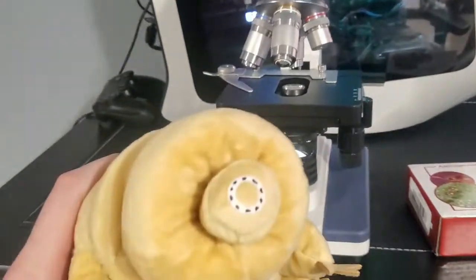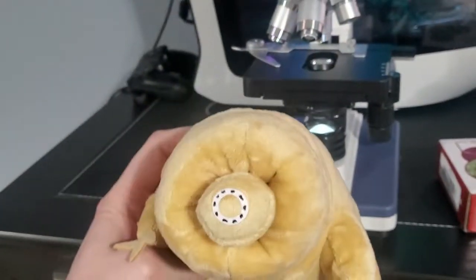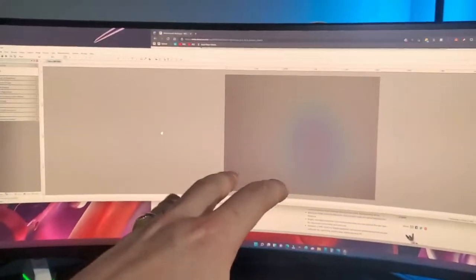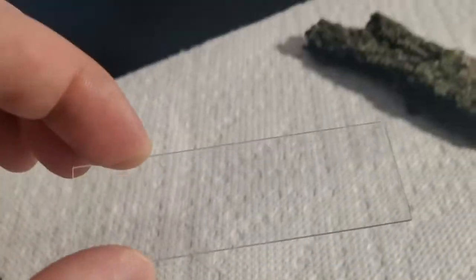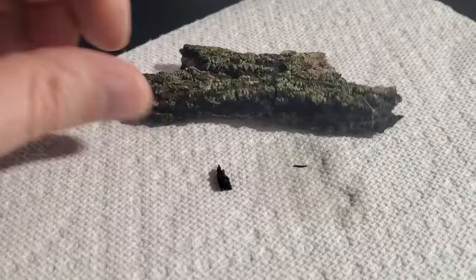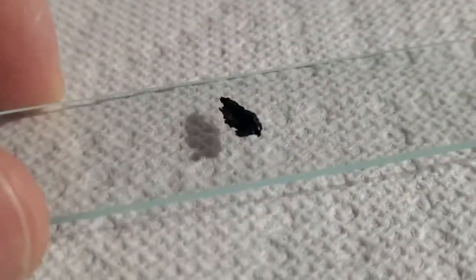Alright guys, we're starting our first ever search for the tardigrade. I'm an amateur at this. This scope, the AmScope, is digital so it goes to the computer screen. I'm taking my very first slide I've ever had and we're going to break this compound down. Look at this — this is a nice piece to start with. We can put that on the slide and get this under the microscope.